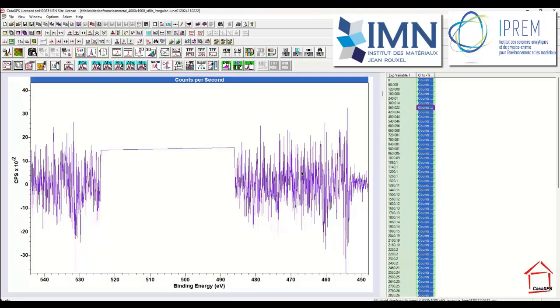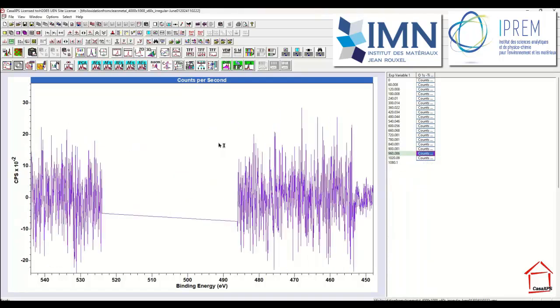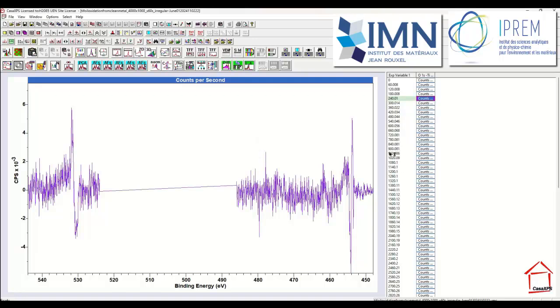We don't need this abstract factor to reproduce the data. All we would be doing if we included this abstract factor into the calculation would be to add back noise. So the idea is to avoid adding the noise that is actually within all of the rest of these abstract factors. And so if we only include in a least squares fit a set of abstract factors where we see something that might be important, then we will have better signal to noise, and the noise will be suppressed in the rest of the data set.